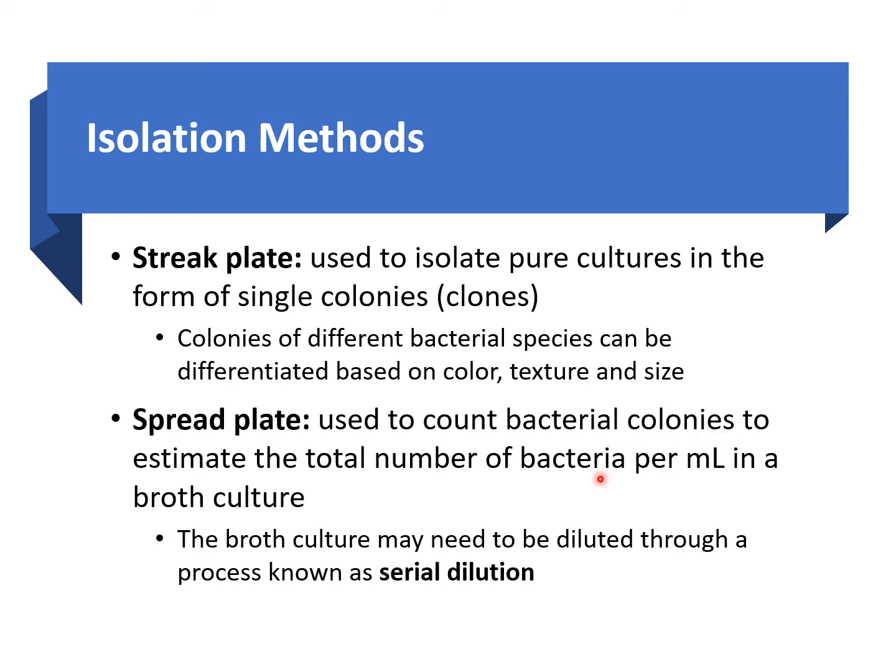Now you might ask, well, why would you want to know how many bacteria colonies you have? Because you might be asked, what is the concentration of your bacteria sample? Okay, so about how many bacteria cells do you have, let's say in a liquid broth medium. You can't just look at a liquid broth medium and estimate, oh, I think I have 100,000 bacteria cells per mL. We can't just guess or estimate. We actually have to do some calculations so that we can figure out exactly how much bacteria we have in this medium.